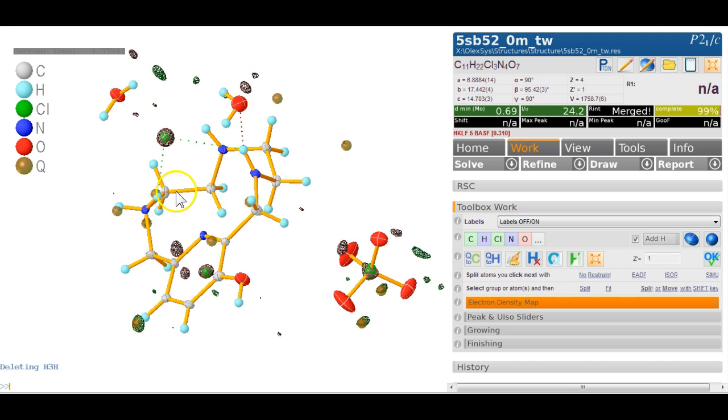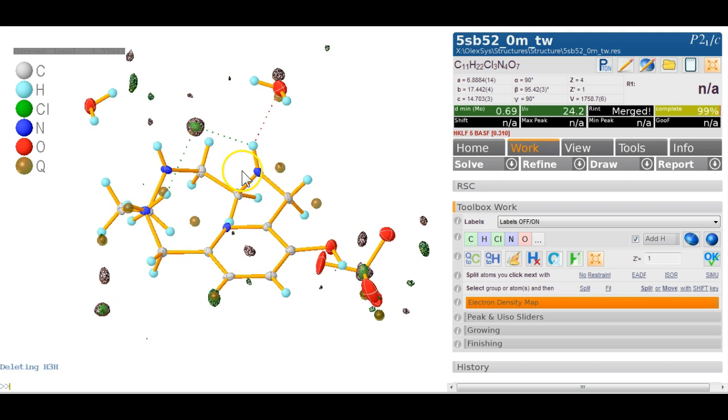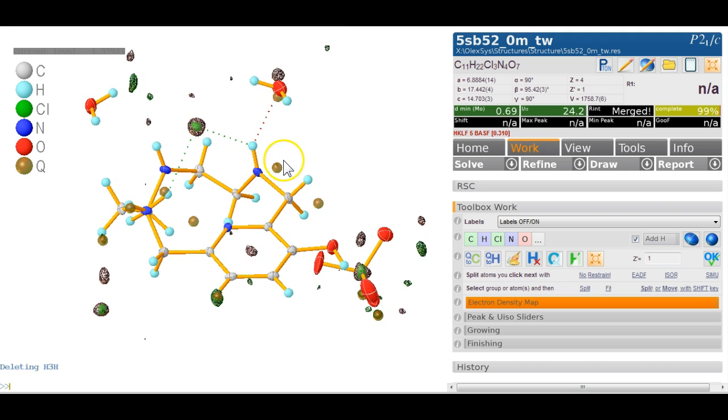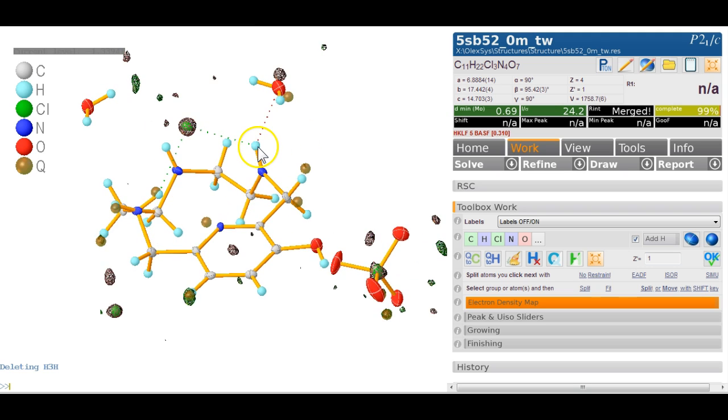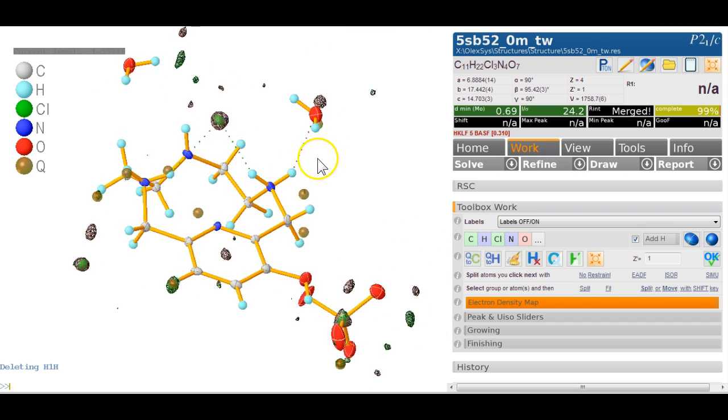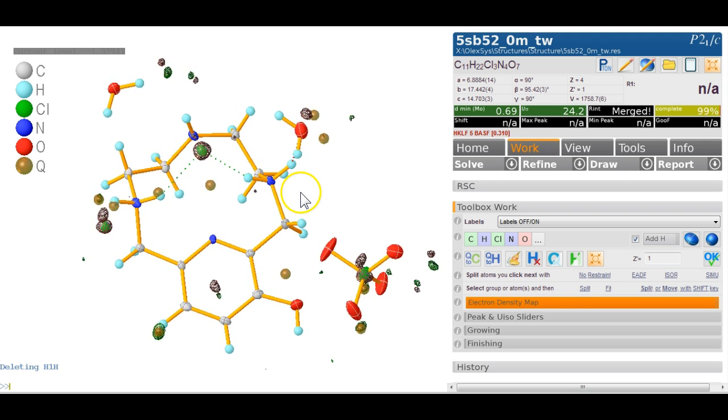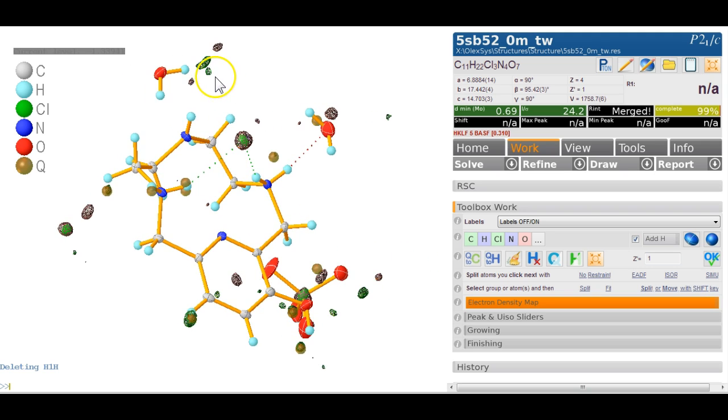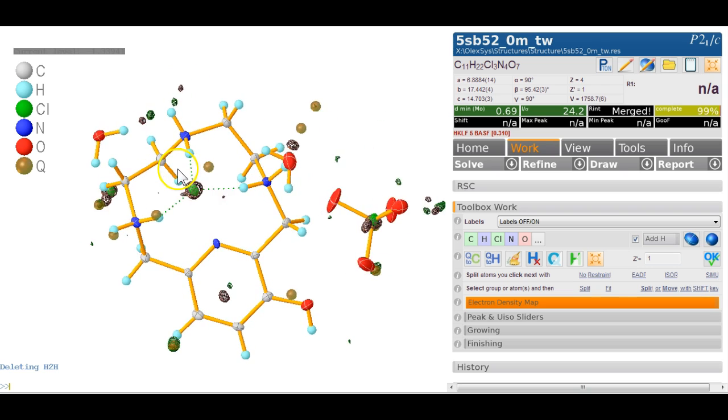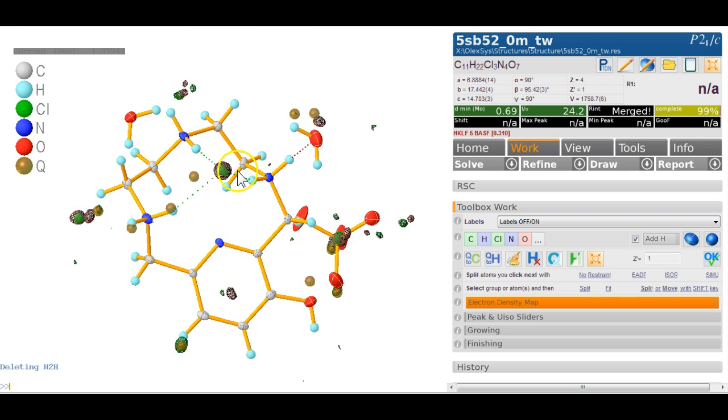Equally, if I look at this one here, this is probably another positive charge. In this particular case, there's no really QPeaks here, but QPeaks are not that reliable when it comes to charges. I'm just going to try this, delete that and type HAD. And yes, indeed the geometry tells us that this is where they should go. So HAD actually works by looking at potential hydrogen bonding directions and there's another one over here. So this thing really is a cation. Type HAD again. Now we found three of them and they all point to this.